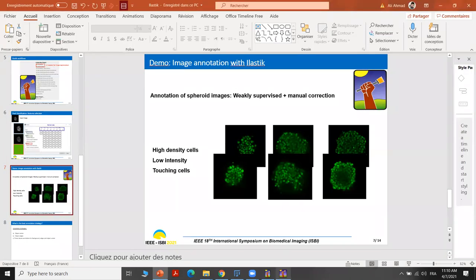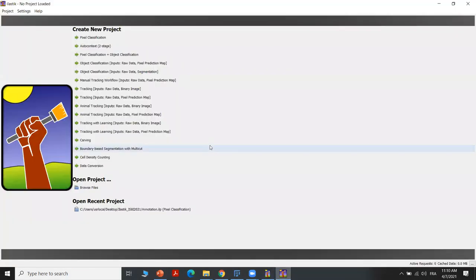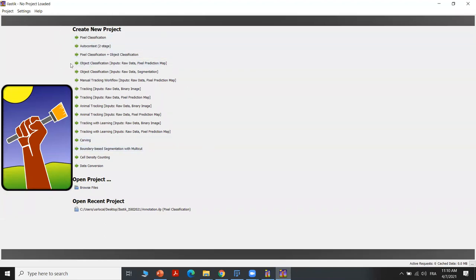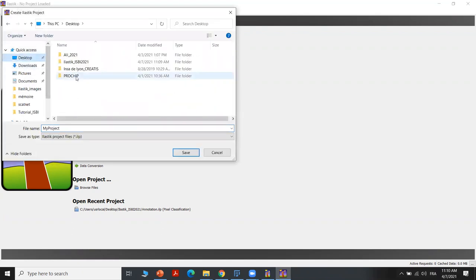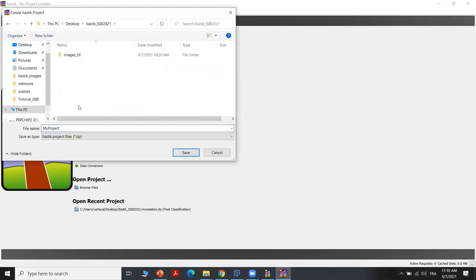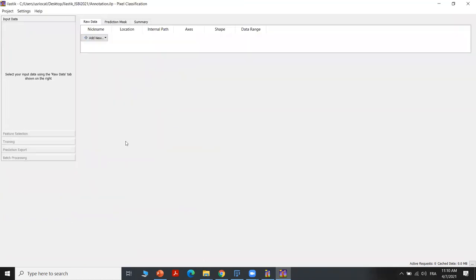The first step is to open Elastik and to choose the project to create our new project. In our case, we are interested in pixel classification. So once we click on pixel classification, we will have to save a new project. We can name it 'annotation' and then save it. After saving the project, another interface will open.